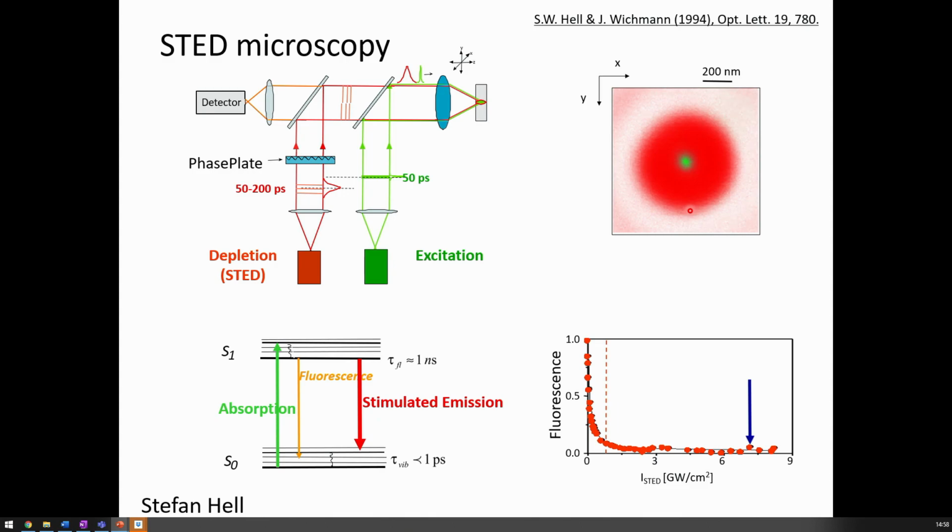On the other hand, the signal you get is just like a normal confocal microscope. The signal you record is the super resolved signal. You need no further image post-processing or anything like that, as you did in STORM or single molecule localization microscopy. You get the super resolution just like that. You're simply drawing with a sharper pencil, so to speak.